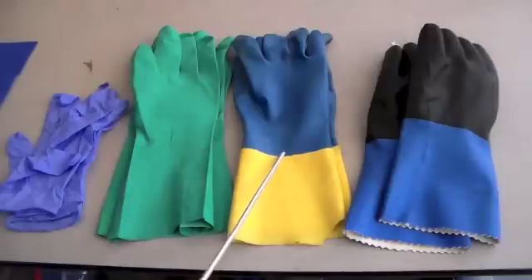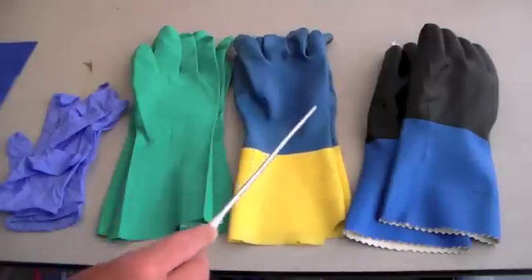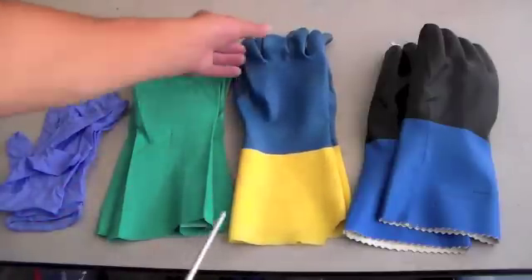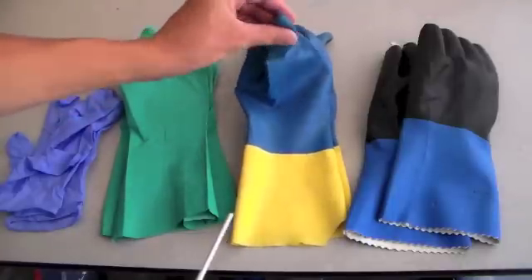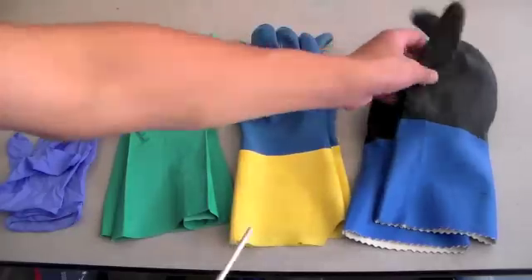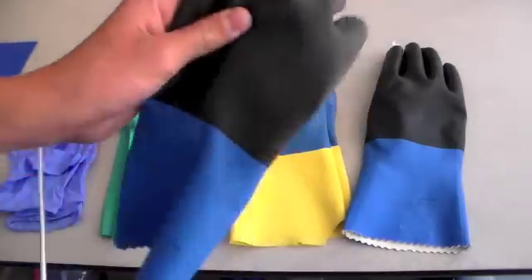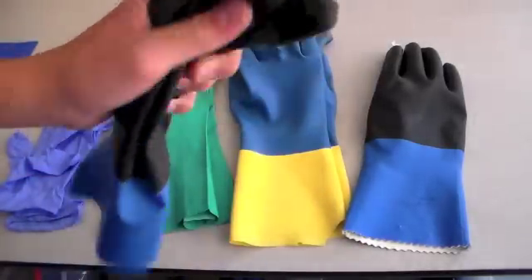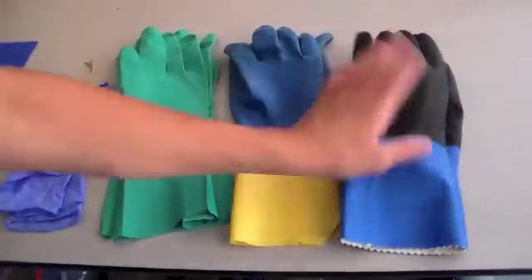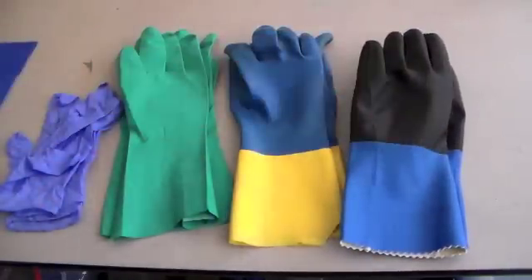Next we have two different types of neoprene. Neoprene latex is neoprene mixed with latex — it's a little more flexible and easy to work with, but if you're allergic to latex it's probably not a good choice. Then there's pure neoprene, which is not very flexible, so it's not great for most tasks, but it's very chemical resistant. It can resist corrosive and oxidizing acids, caustic alkali, hydrocarbons, and alcohols.